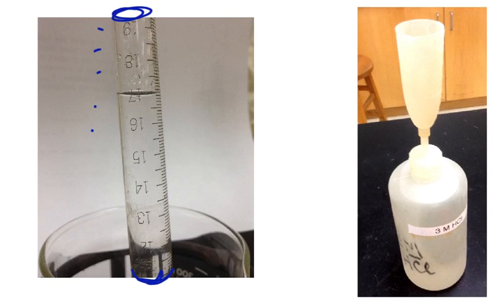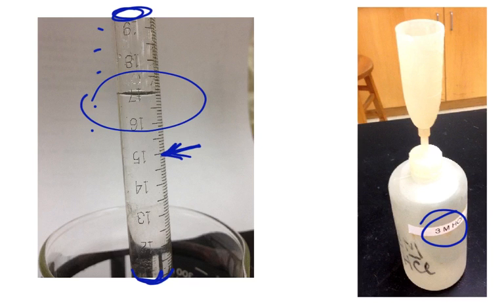And we want approximately 15 milliliters of our 3 molar hydrochloric acid. So it doesn't have to be exact by any means. Anywhere from 10 to 20 will work. So in this case here, I got about 17 milliliters. That would be fine. So don't waste your time trying to get exactly 15 milliliters because that's excess acid, more than you need anyway, so just don't worry about it.